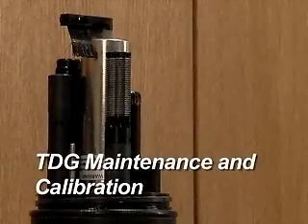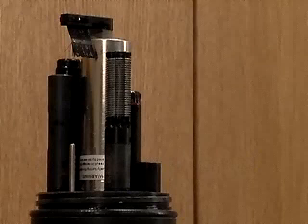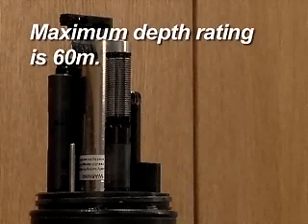TDG Maintenance and Calibration Function. The TDG sensor, or total dissolved gas, is a sensitive pressure transducer attached to a tube of gas permeable membrane. The pressure of the gas dissolved in the water will reach equilibrium with the gas inside the membrane, where an accurate measurement can be taken. The maximum depth rating for the sensor is 60 meters.